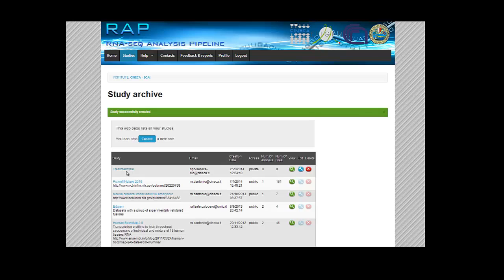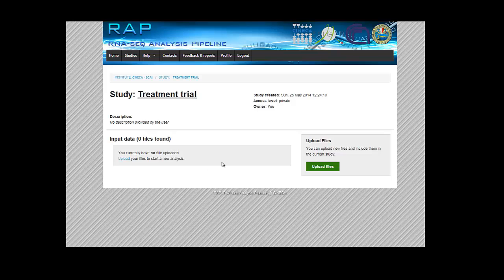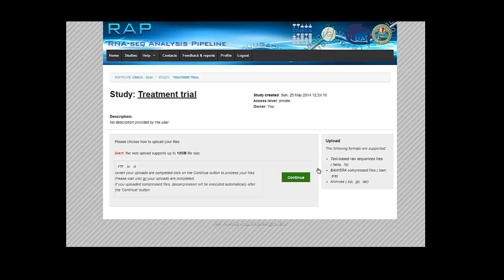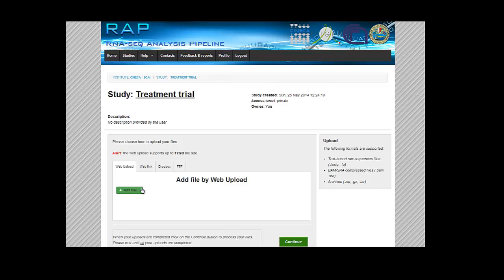So let's get inside the study. Here you can see that you haven't uploaded any files yet, and of course we have to so we can start a sample analysis. So let's click on the upload files button. The REP tool gives several possibilities to upload your files. You can use our web platform, but of course you should have a high-performance internet connection in order to complete the upload during an acceptable time.